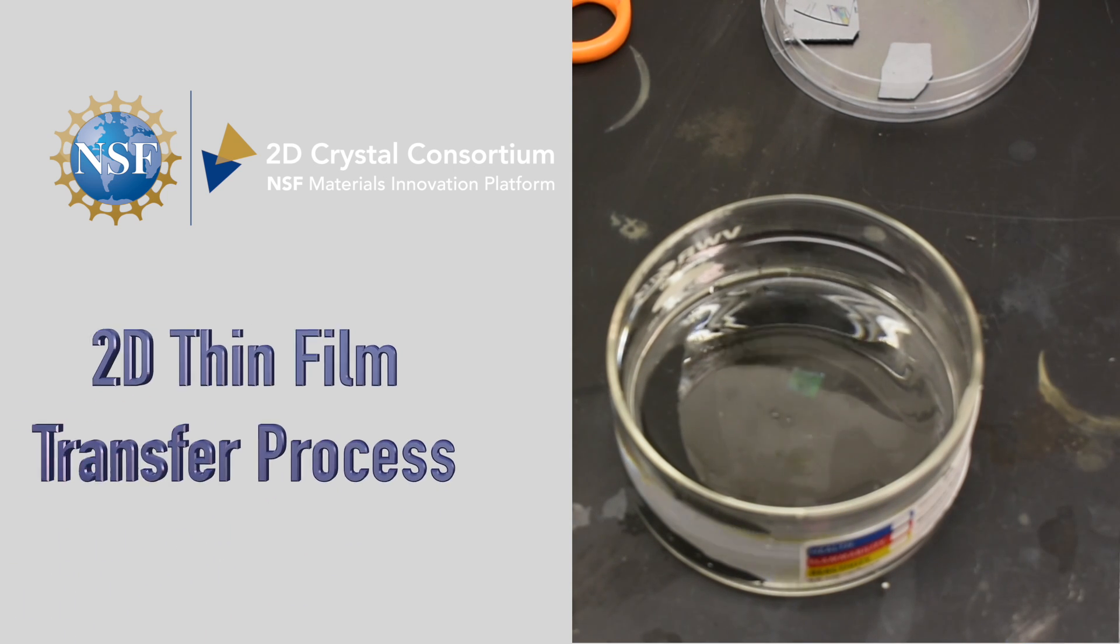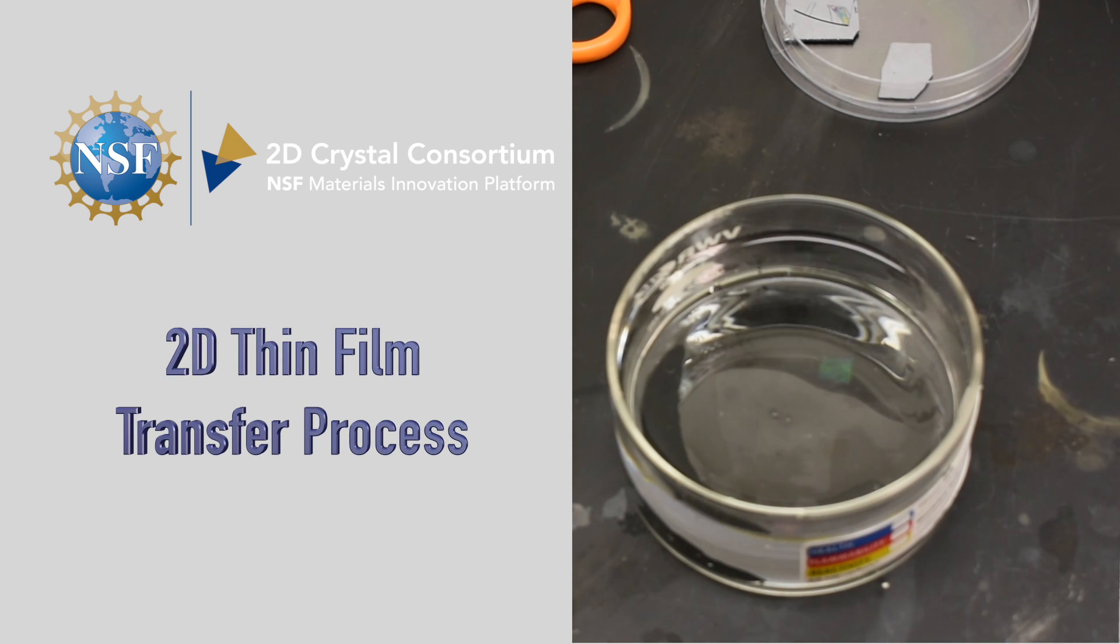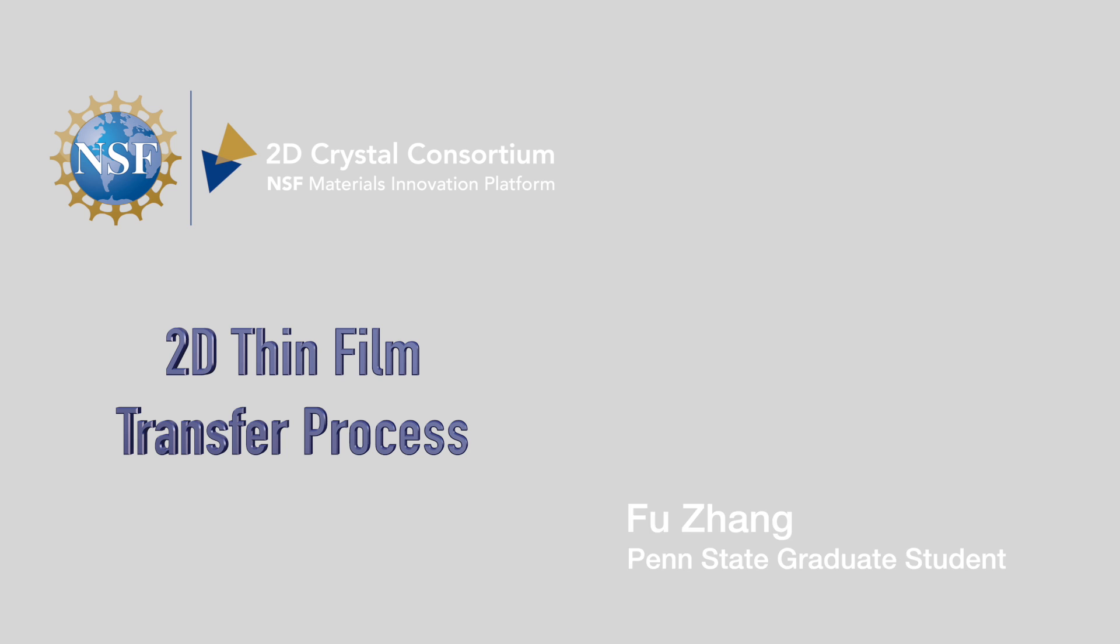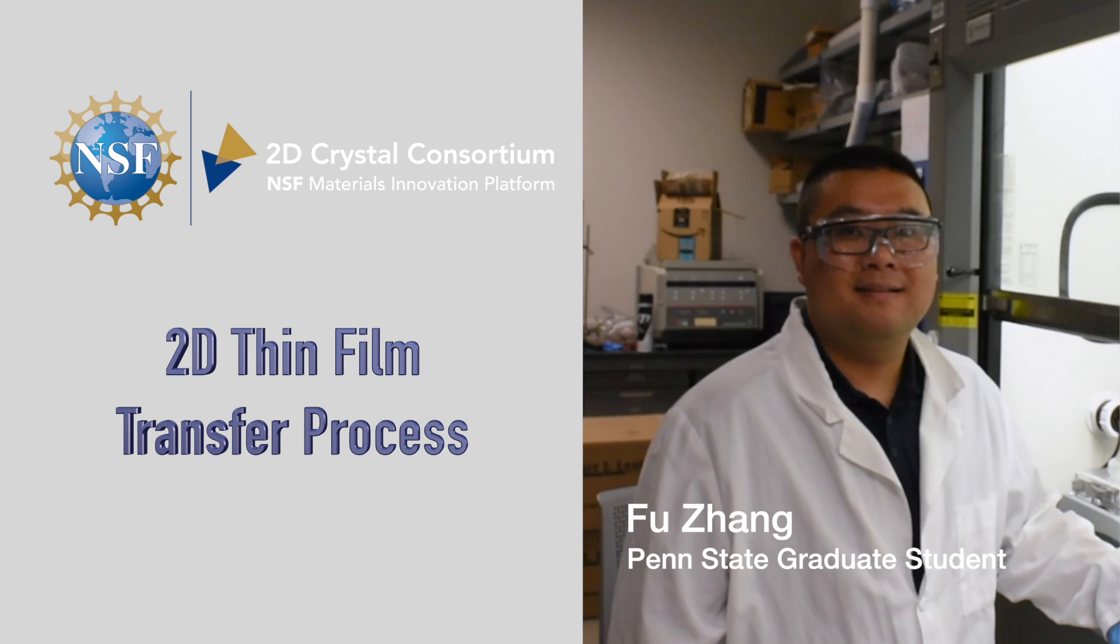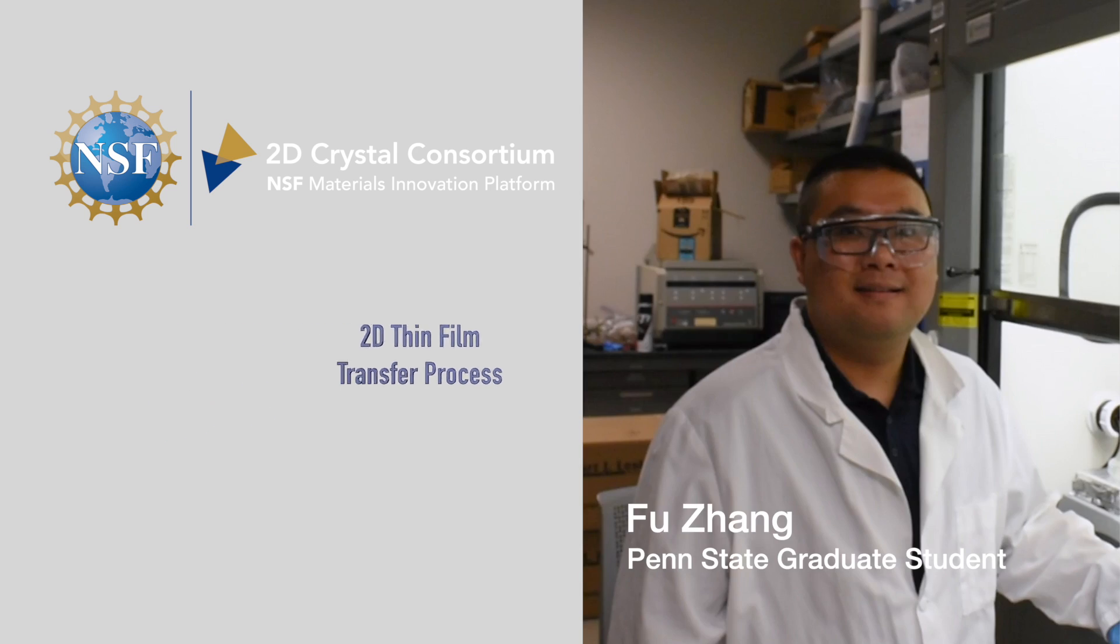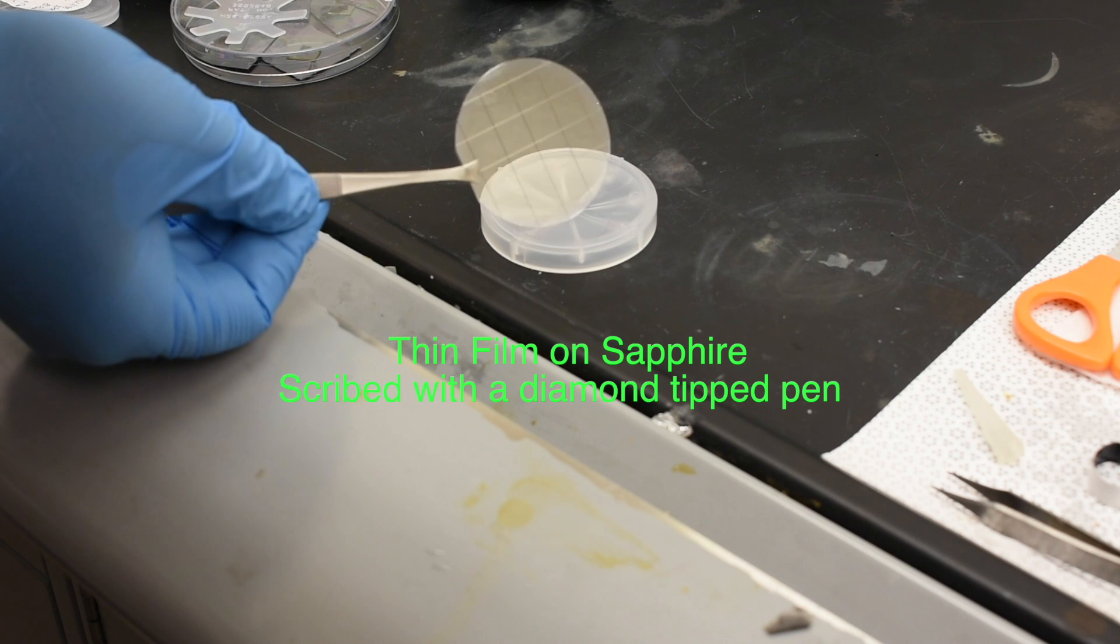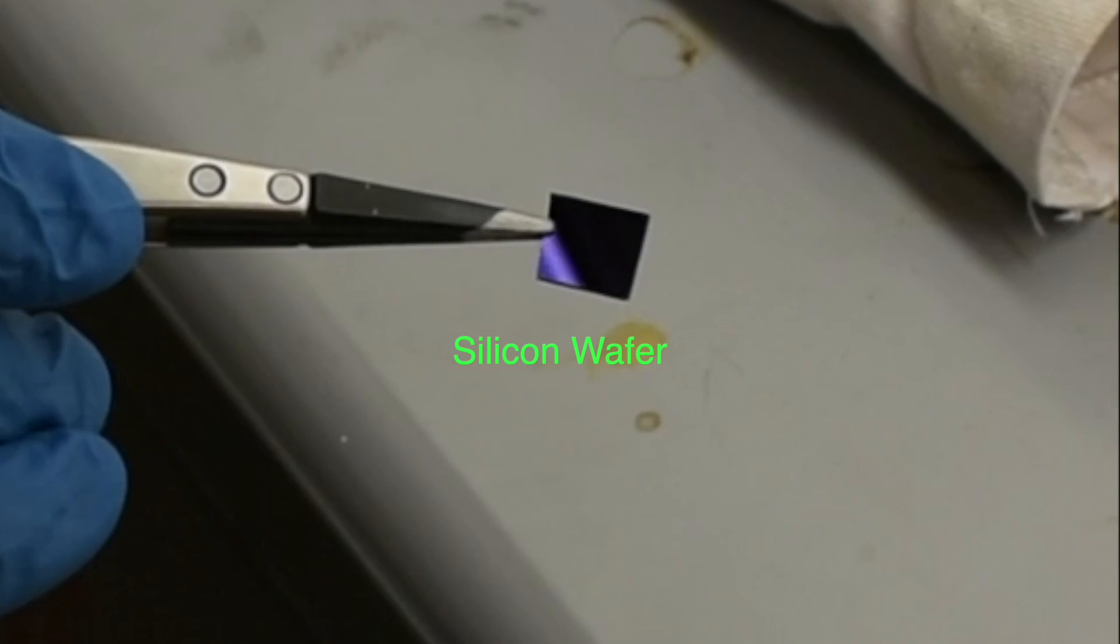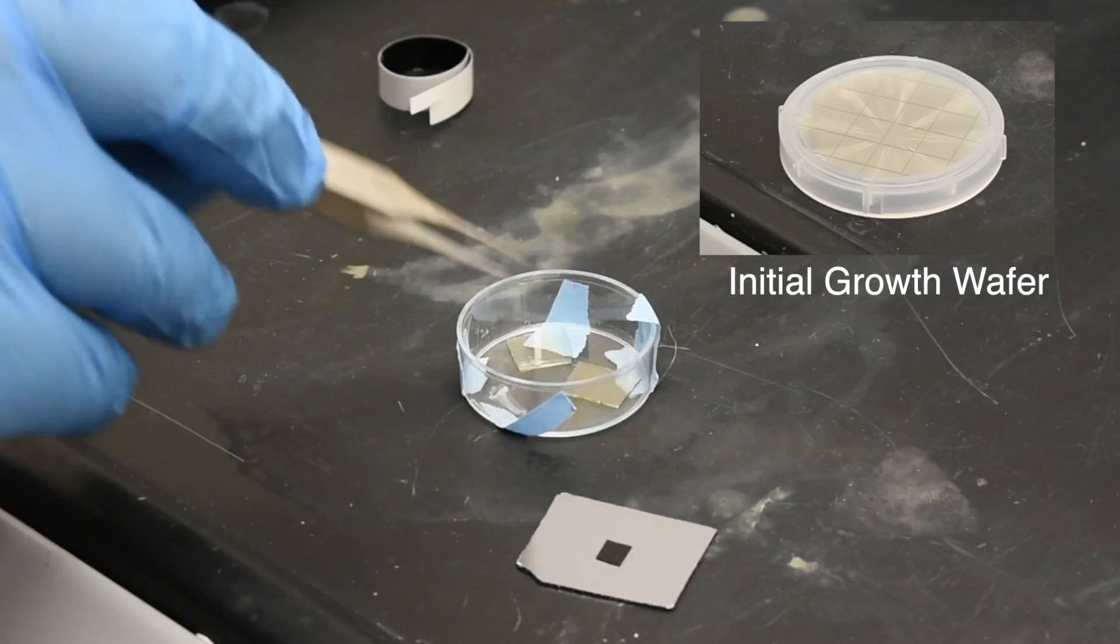In this 2D Crystal Consortium video, Penn State graduate student Fu Zhang demonstrates his procedure, published in 2018 in the journal Nanotechnology, for how he transfers 2D layered thin films from his initial growth substrate to a different final substrate.